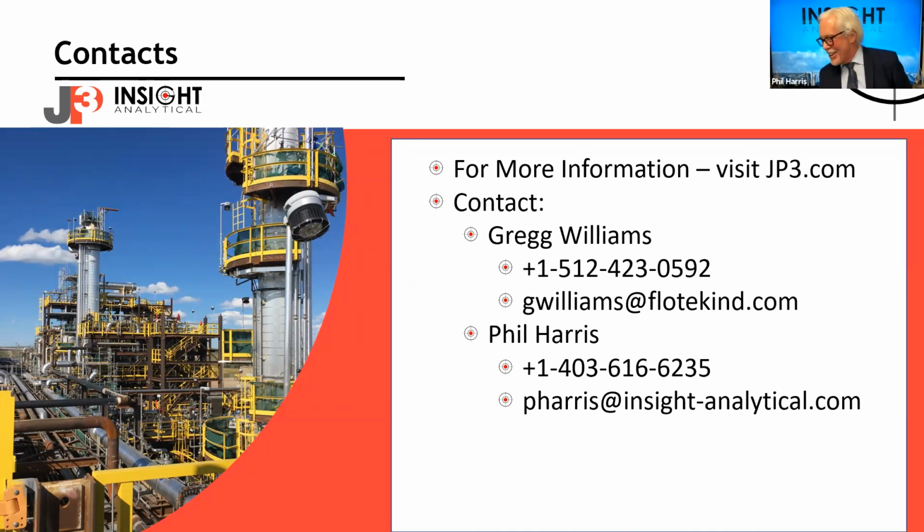Hey, Henrik. Model IP, that's an interesting question. I might let the JP3 guys handle that. Typically right now, and this is one of the things that's been a bit different: when you were looking at FTIRs and refineries, oftentimes the refinery, or the oil company, would have its own chemometricians, and they would build their own models. One of the things JP3 has brought to this is the idea that we'll put the spectrometer out there, get the data, organize the lab data, and build your models for you.